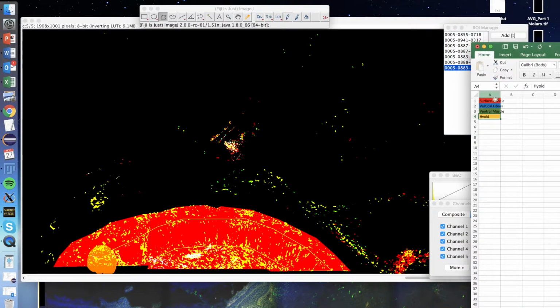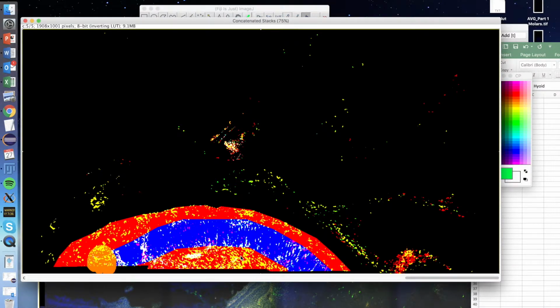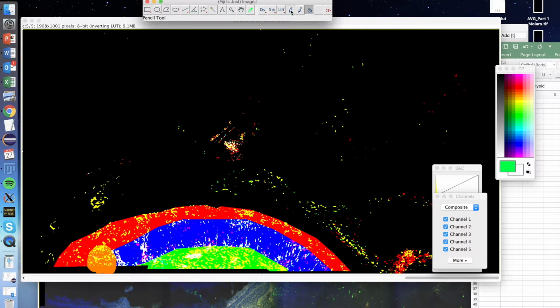These were the vertical fibers, we wanted those in blue. So we go back into our color picker and click blue. There we go. Now this bit we want in green. Now I could do all this other fancy stuff to do it. Or I believe, seeing as it's just a contiguous shape, it's not connected to anything else, I should just be able to fill it in green. So I just did the fill tool and clicked it in green. Now later, there we go, that's a map.